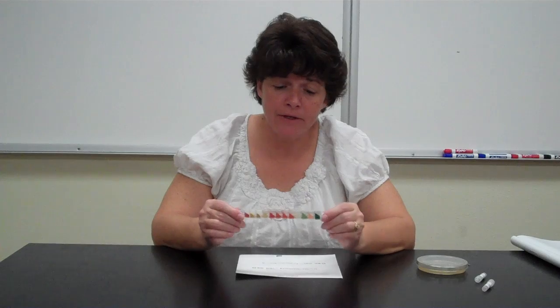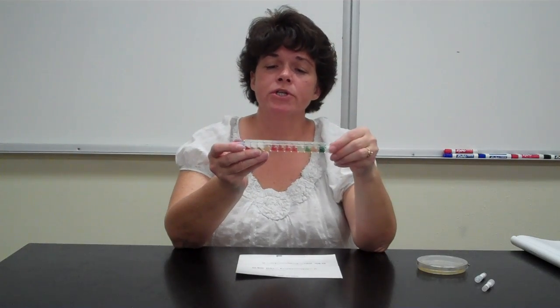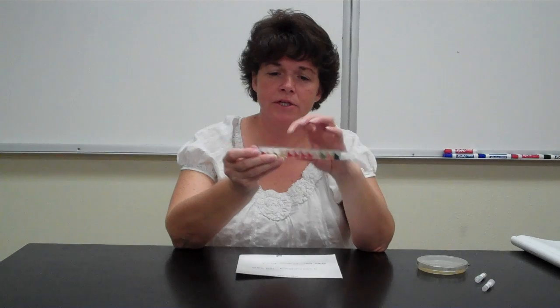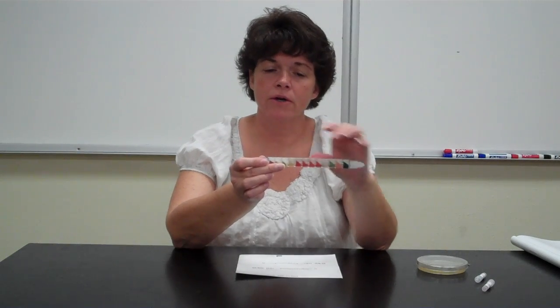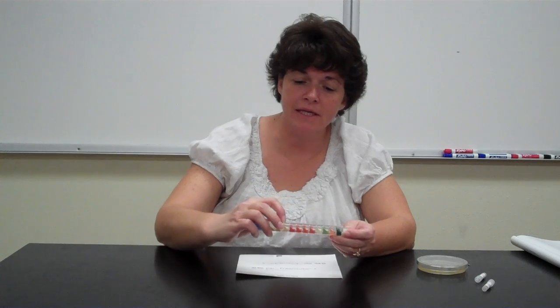Now in the lab manual, it actually tells you to use a syringe to inject your stuff into there. But we don't have the syringe. What we're going to do is for the indole test, which is this 4th compartment here, you're actually going to take a loop and flame the loop until it gets nice and red, and pierce the plastic, putting a hole in the plastic.